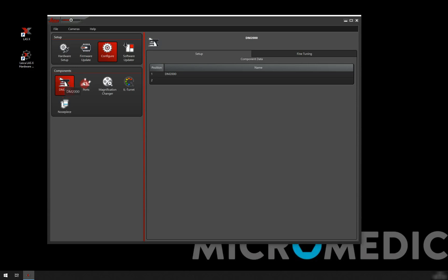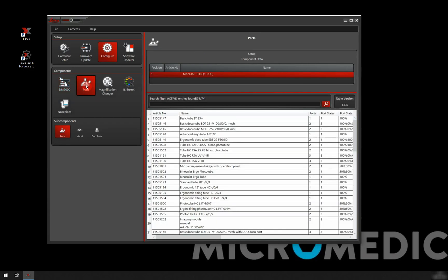The first thing we're going to go into is the ports. This is where we choose our tube. The easiest thing here when you add components is if you have all the article numbers for all the components that you have on your microscope.